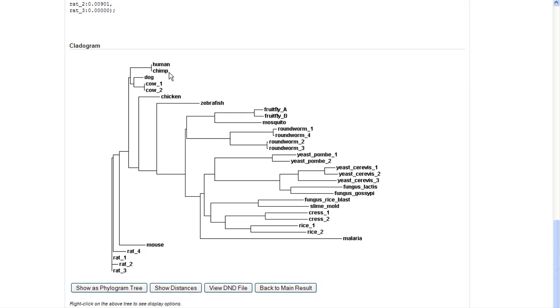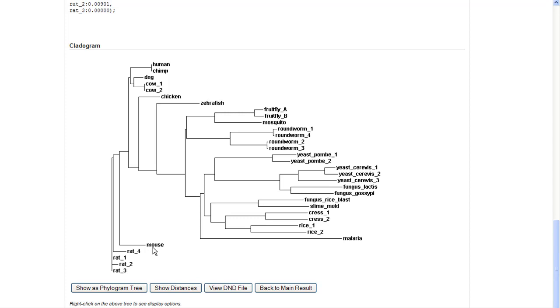So here's human and chimp, they're right on top of each other because, of course, we saw the sequences were the same. Here's cow one and cow two, the duplicated genes. Those are obviously very recently duplicated genes, and they're related to dog. Down here we had four of the isoforms from the rat, and they're all very closely related, and they're very closely related to the mouse. Then as we go along, all the chordates are close together: chicken to zebrafish to human to chimp.